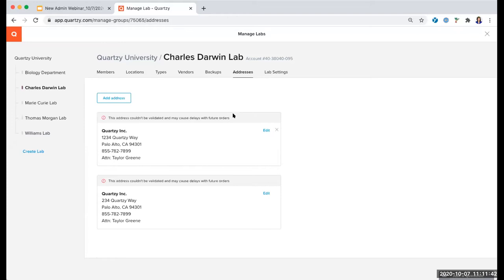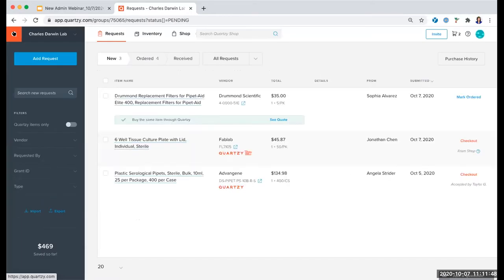To get out of my Manage Labs area, I'm going to click on the Q logo at the top left, and this is going to return us to the request table where we're going to look at processing requests and placing orders. Let's dive deeper into this request module. As I mentioned earlier, this is your lab's digital shopping list — requests for any and all items that need to be purchased can be tracked here, whether or not the purchases for those items will go through Quartsy. The Add Request button is going to be the best place to start when something needs to be ordered.